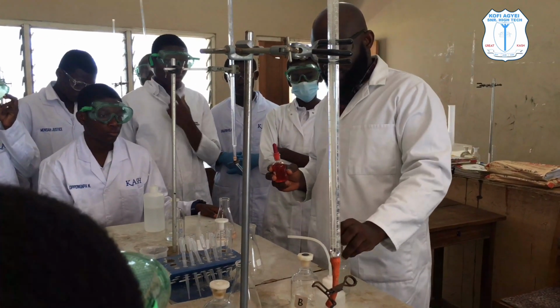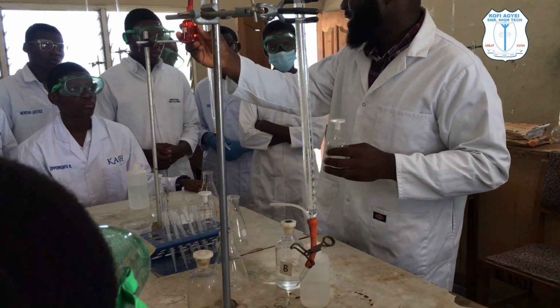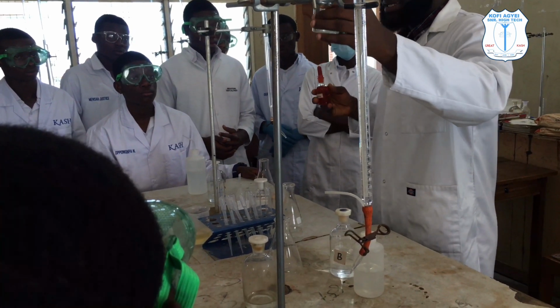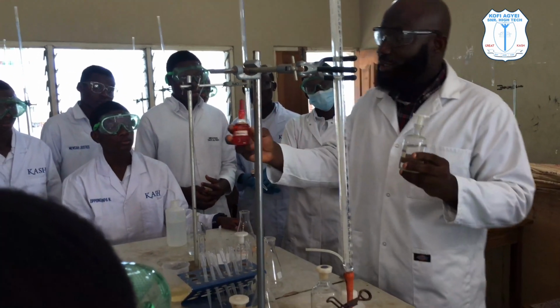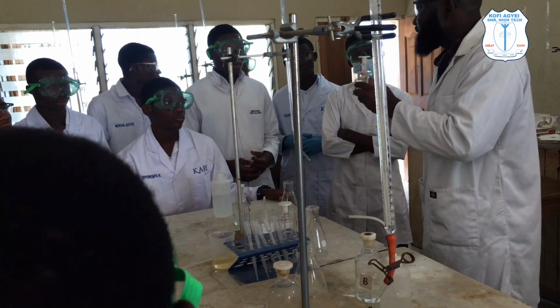Phenolphthalein. So in the exams, they can ask you, what is the color of methyl orange indicator? The color is orange, right? What about phenolphthalein indicator? Colorless. Understood? These are the two common indicators that are normally used in acid-base titration.